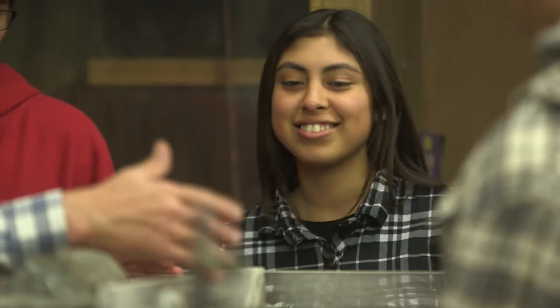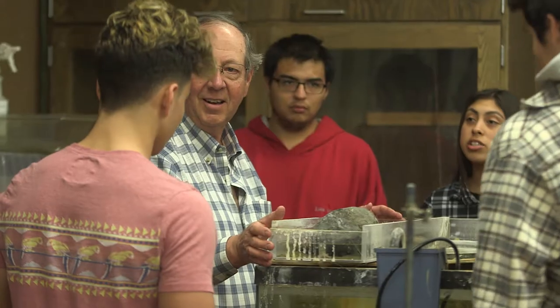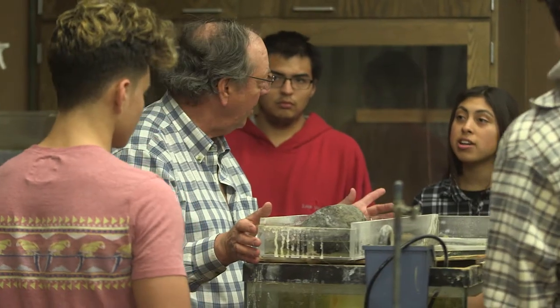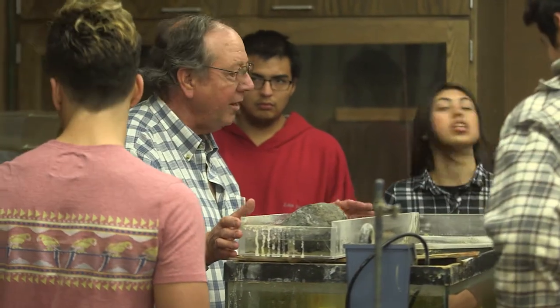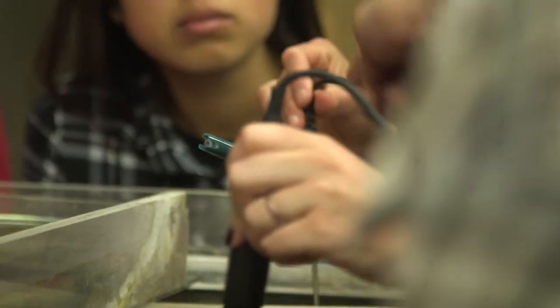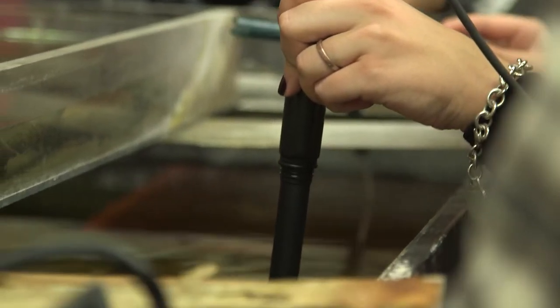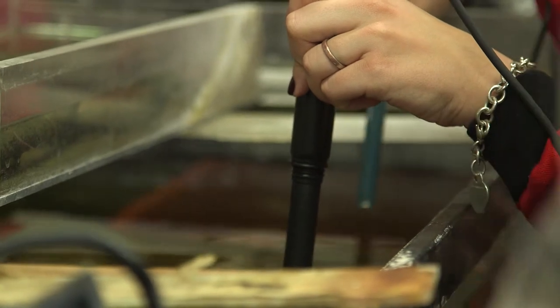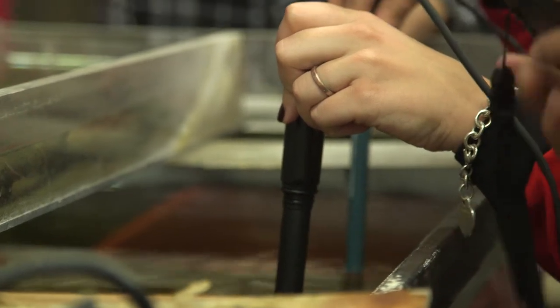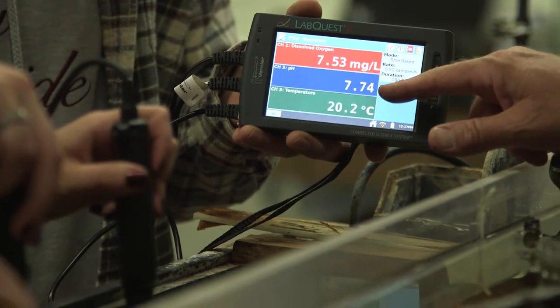But in a pond system, what are some of the things that you would want to measure? Oxygen. Carbon dioxide. So we can measure dissolved oxygen — that's the oxygen that is dissolved into the water. We'll take the pH, so 7.6 milligrams per liter. That's dissolved oxygen.